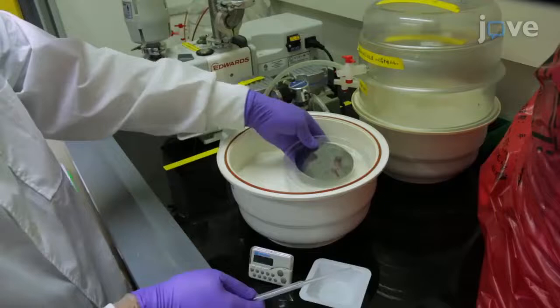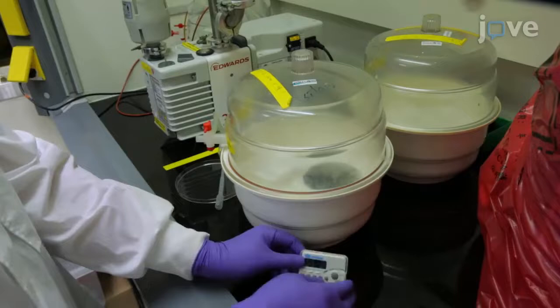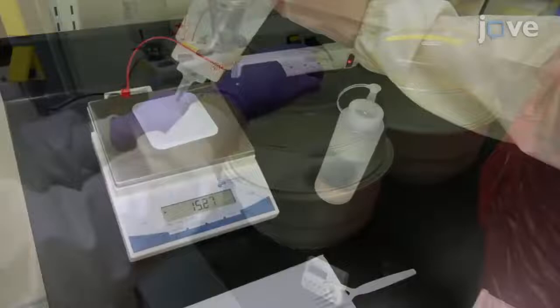Start by preparing the PDMS device. Place a wafer mold and a weighing dish with 100 µL of trichlorosilane in a desiccator and apply a vacuum for 15 minutes. Stop the vacuum and silenize the wafer mold and the desiccator at 37°C for at least one hour.